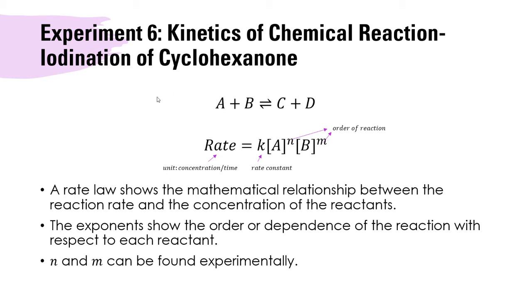Today we're going to discuss another experiment, which is on the kinetics of chemical reaction, and that particular reaction is the iodination of cyclohexanone.